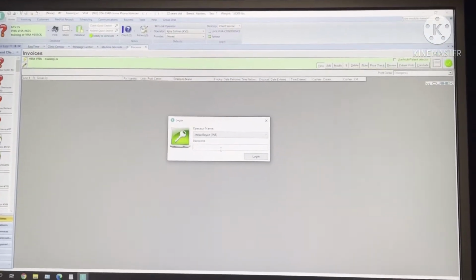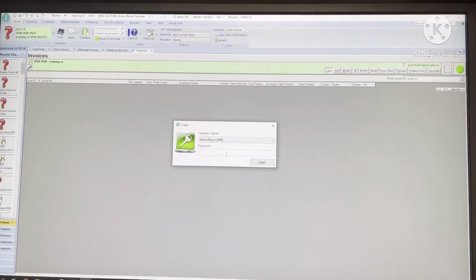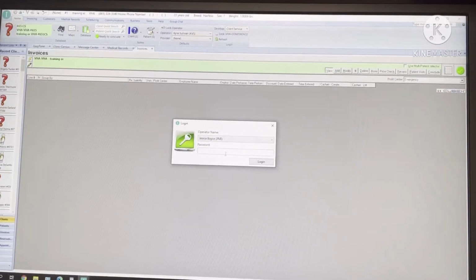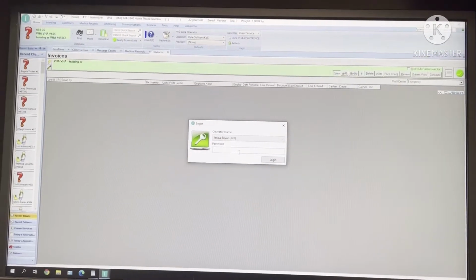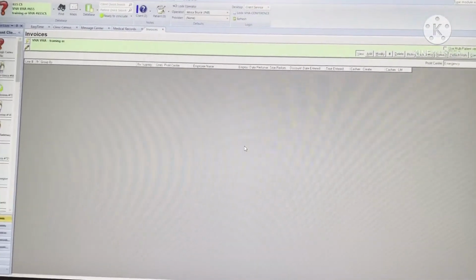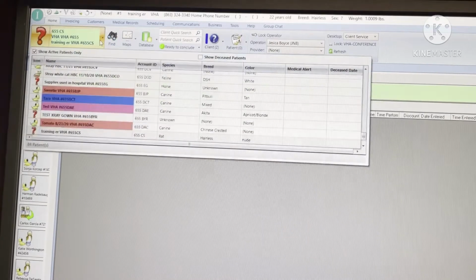So in this video, I'm just going to briefly explain how we order and request any labs that we are doing for our doctors. So the first thing you want to do is go to ImpriMed. You want to go ahead and sign on and pull up your patient. In this case, I'm just going to use one of our test patients.